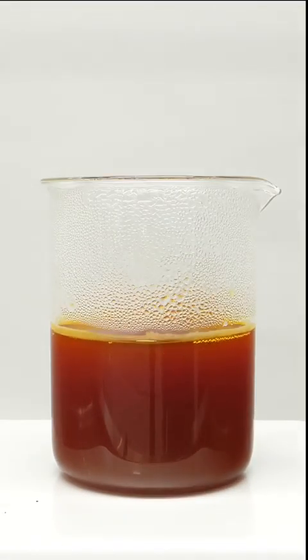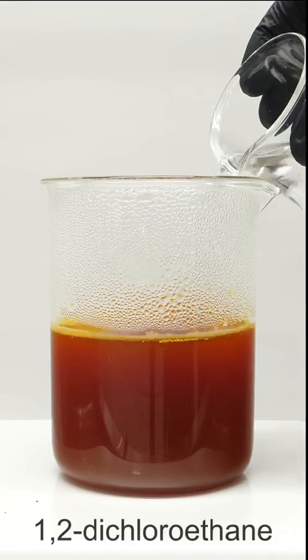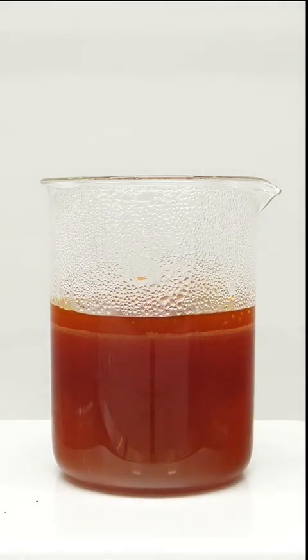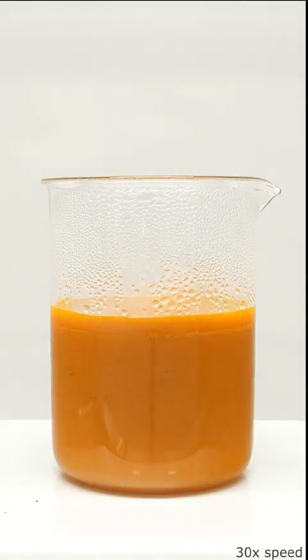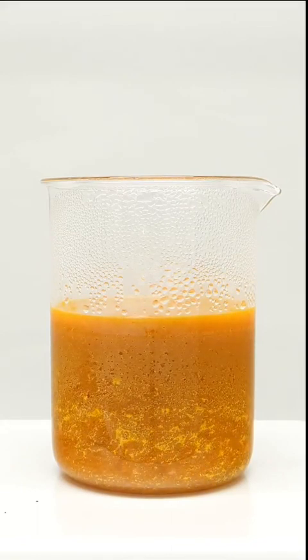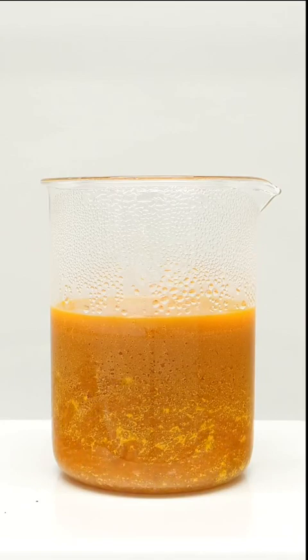To do this, I just need to add something called 1,2-dichloroethane. It again didn't look like much was happening, but then the color quickly changed and I started seeing some solid stuff. This was all something called thiokol rubber, and now I basically just had to wait.